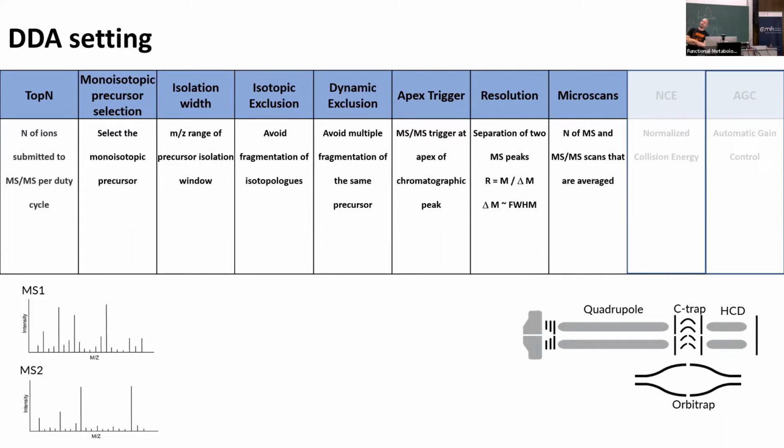How many scans do you accumulate on the timsTOF? Okay, well. They accumulate for 1 and that depends on the width of the chromatogram. So it's way more. So it scans at way higher speeds. But if you would not accumulate them and get only single scans, it would be very noisy, right? So there it's really important to set that appropriately.